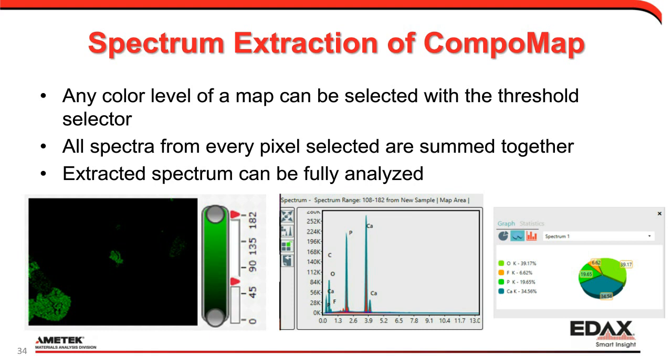How many minerals are included in the spectral library? Our mineral library is the 53 mineral library, but always growing, and we have some nice budding partnerships with some of the companies mentioned and referenced here, and also available on your widgets. You should have some links to them. We also have a materials library, and in combination there are about 150 minerals and materials in the library. But again, always the ability to grow.